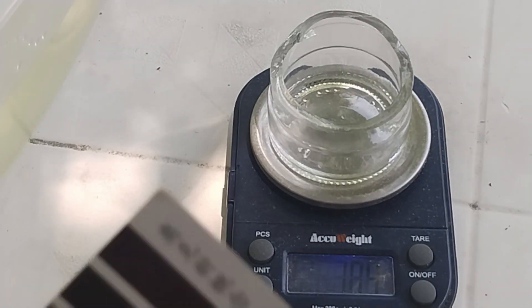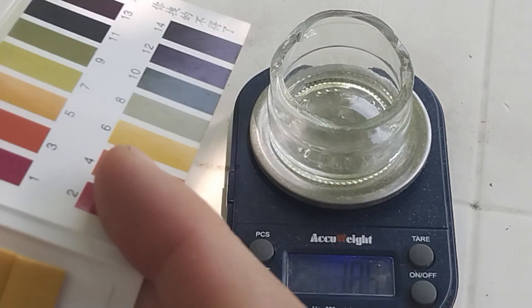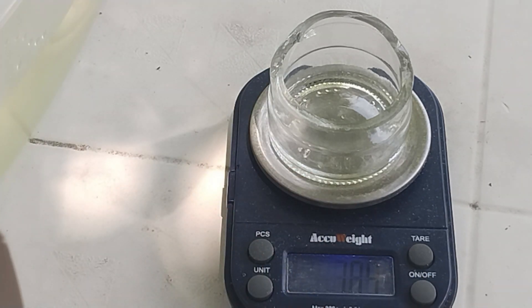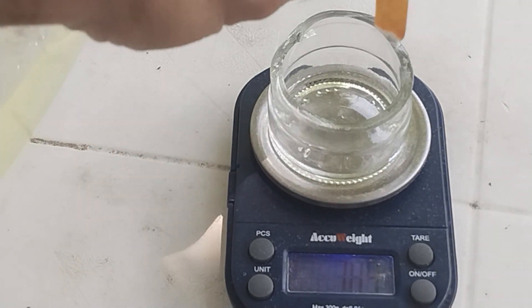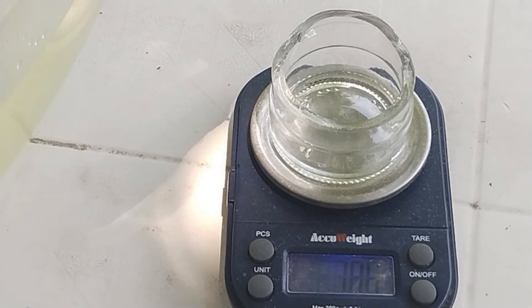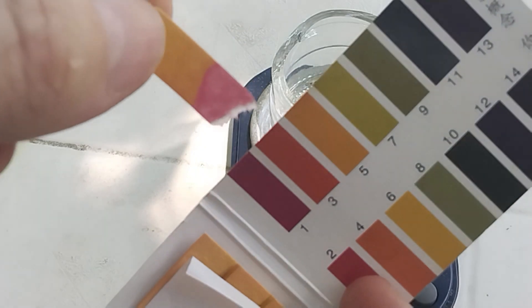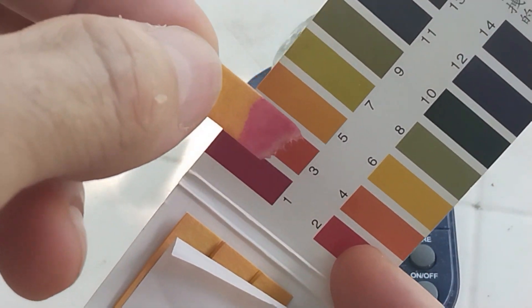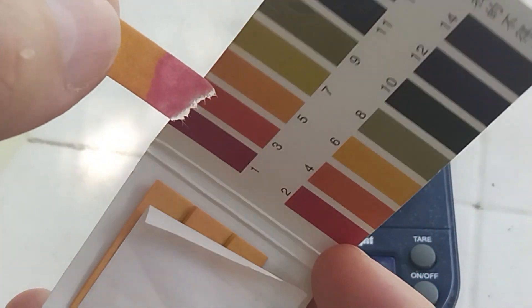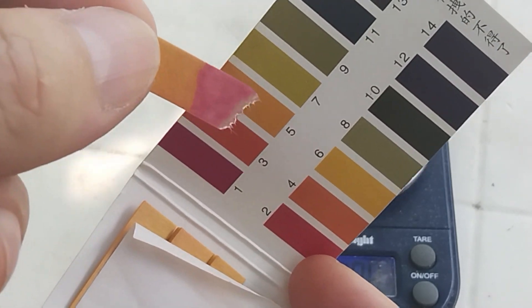Now we may want to check the acidity — the pH. It's definitely acidic. So it worked.